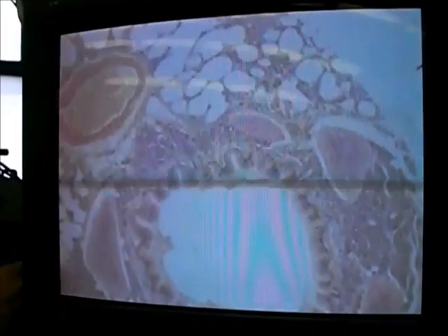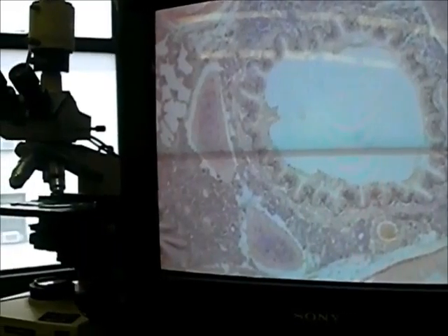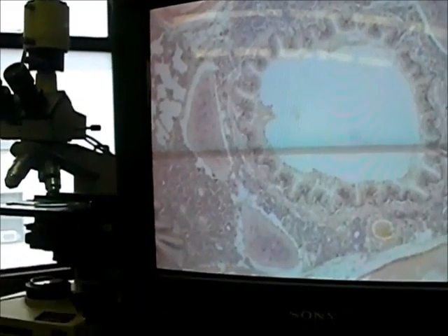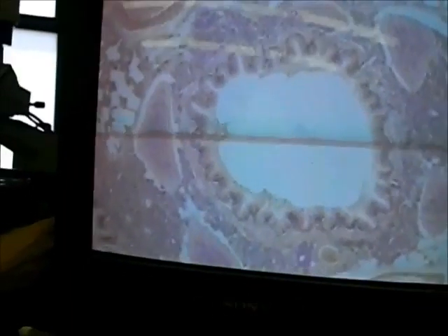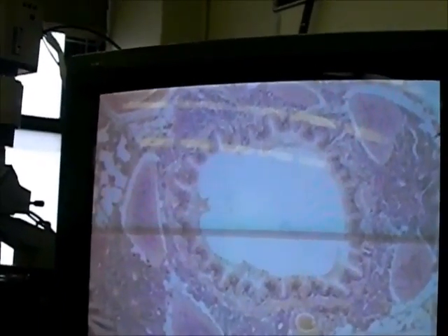Now, what's nice about this slide is we also use this as an example for an artery and a vein. In your microscopes, they will both fit in the field under low power. So which one is which? That's an artery and that's a vein. The flatter one with thinner walls is always going to be a vein, and the thicker, circular one is the artery. I might use another tissue; I might find the pancreas has a very nice artery and vein. But arteries are arteries and veins are veins.